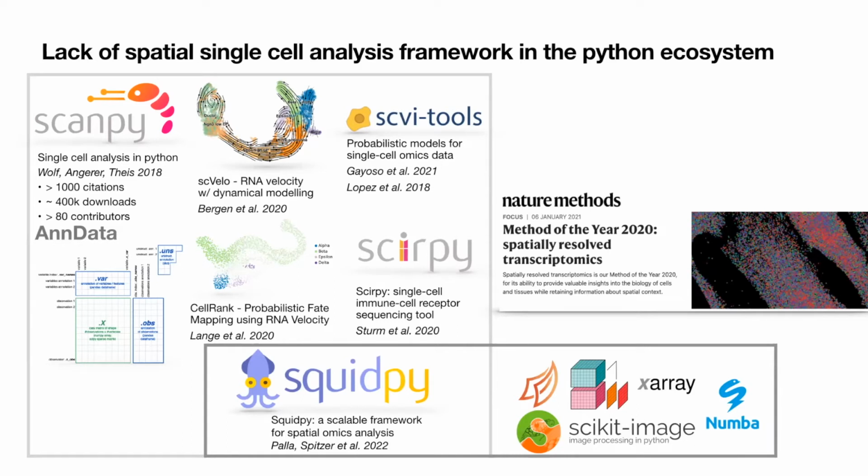Essentially, we're trying to really integrate this into the ecosystem by, like I said, using the AnnData formats and keeping the same principles of modularity and scalability that we also have in ScanPy. We also tried to name the functions quite similarly to how you would use them in ScanPy, and to make it quite seamless for you as users. If you're used to how ScanPy works, then Squidpy works in a very similar way.